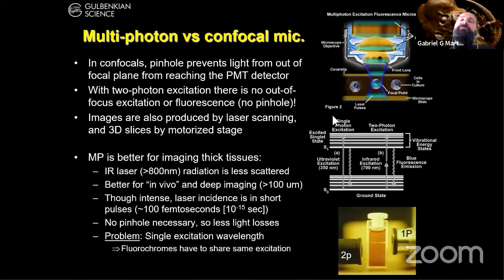On conventional confocal microscopy, if you're trying to look at GFP, for example, you know that you're using blue light. Blue light goes through your biological material. The objective is focusing it on a very tiny spot that flies through your sample. And as the spot is flying through the sample, you're basically generating green fluorescence. The green fluorescence travels in the opposite direction, is picked up by the objective, and it's detected by whatever detector you're using.